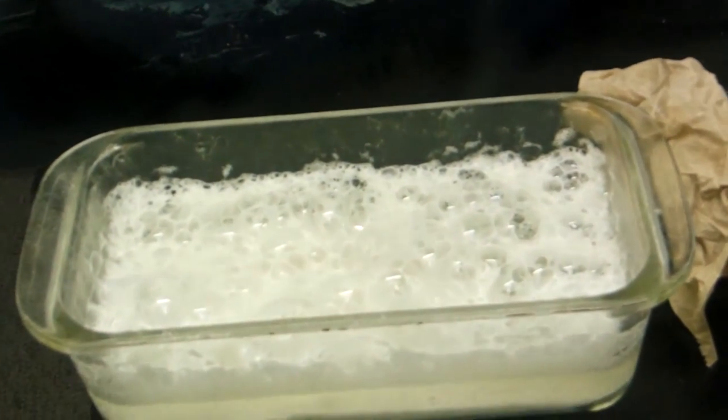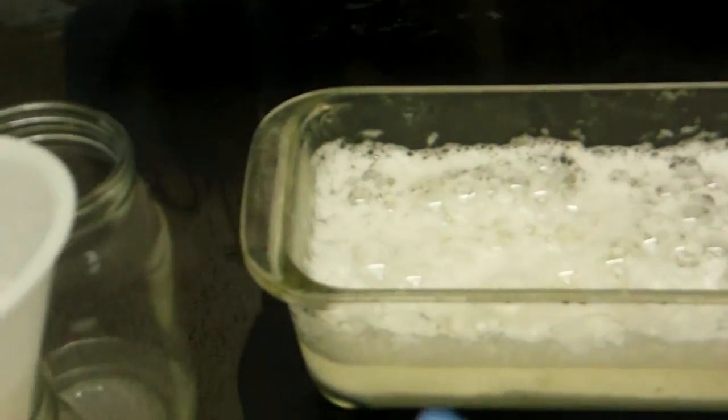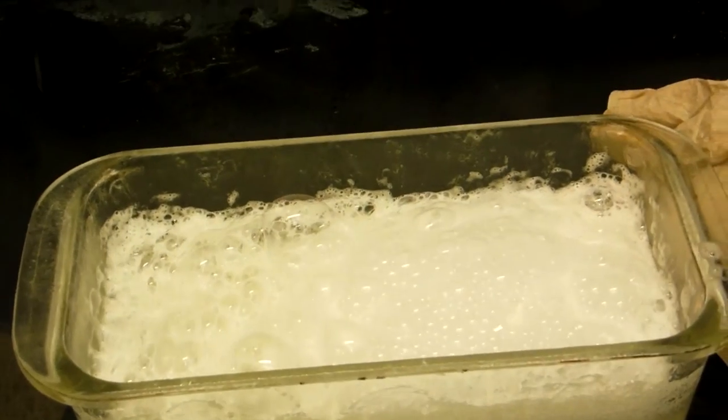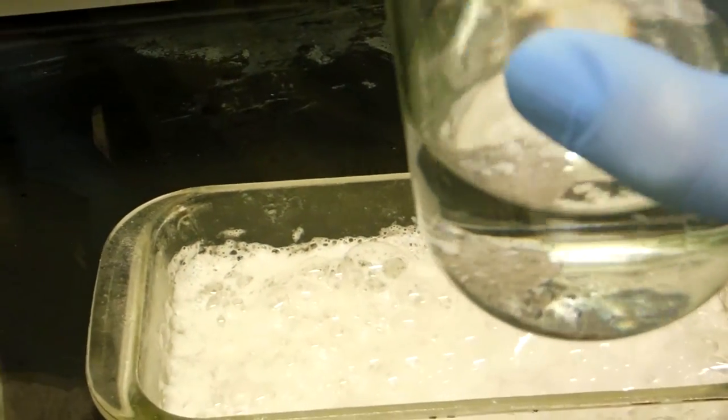However, before it can be poured down the drain, it will need to be neutralized. Since my solution is highly acidic, baking soda is used in this application. As you can see, it's quite foamy. Whenever I pour in the acid solution, it foams up because the acid is being neutralized by the baking soda, which is a base.